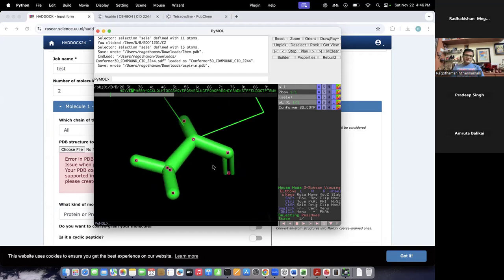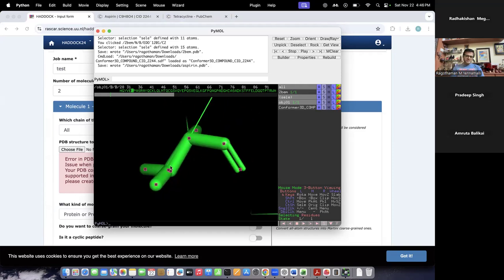So there are two conformations, as you can see here. You can see a split, a small line here. So you have to process. This is part of the processing of the file, where you select only one conformation among the two known conformations. So how do you see this in the PDB file?